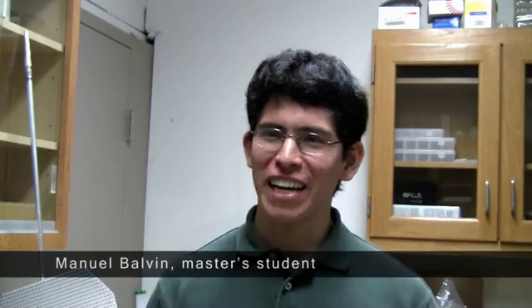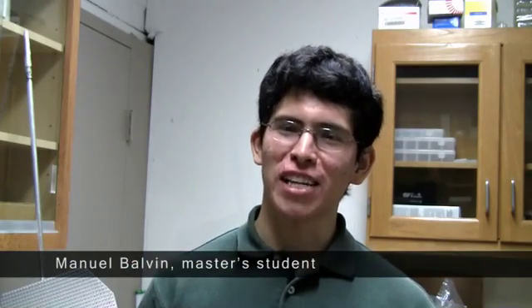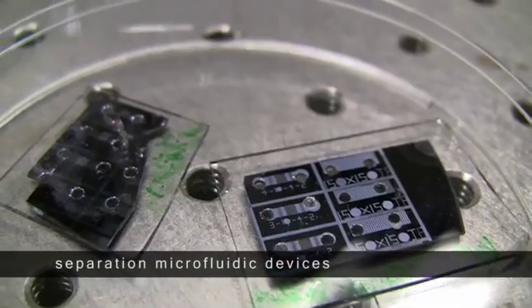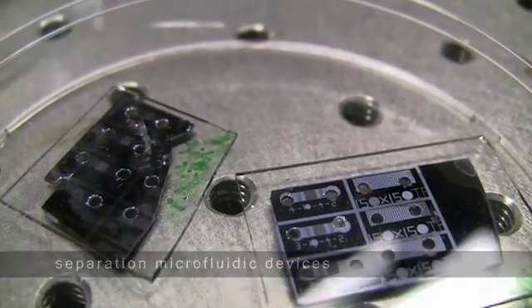Hi, my name is Manuel Balvin. I'm here at Baltimore, Maryland in Johns Hopkins University, the Department of Chemical and Biomolecular Engineering. What we plan to do is gain a better understanding of how separation microfluidic devices work.